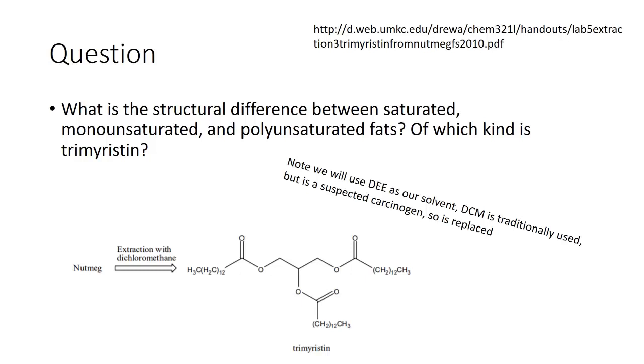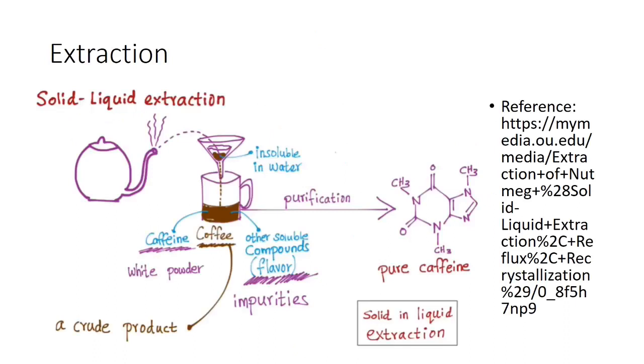So your first part of the lab is that you will be extracting some compounds out of nutmeg, just like how people extract coffee from the coffee beans to drink. So the coffee that you drink, what they do is use hot water to remove that because it's a faster process. You're going to get the coffee out faster, and the coffee will come with caffeine. So if you wanted to extract caffeine, this is actually how you do this.